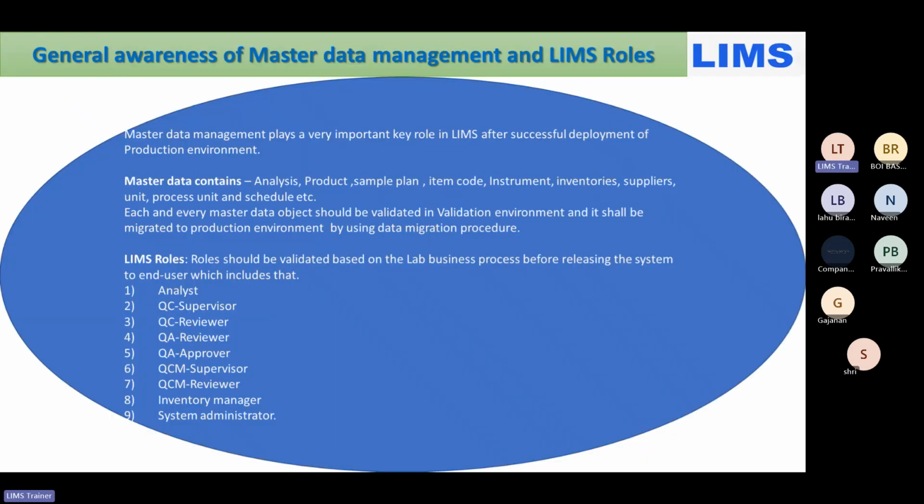Now comes the master data. It plays a very important key role in the deployment of the production environment, because if the master data is not proper with the software, you cannot go for the production environment. In the production environment, you are going to test the different analyses, sample plan and item code according to the master data. That's why master data creation is very important. How it is created and how it actually works, we will see in further lectures.